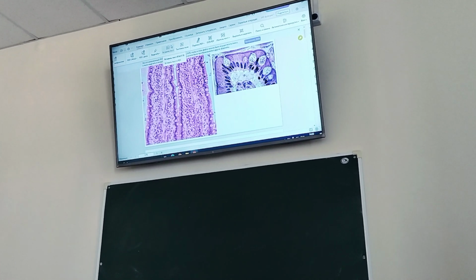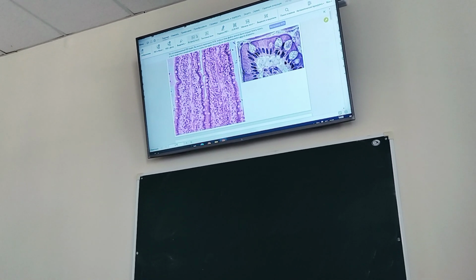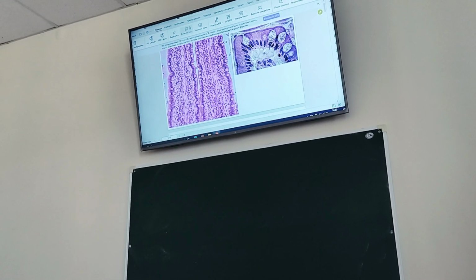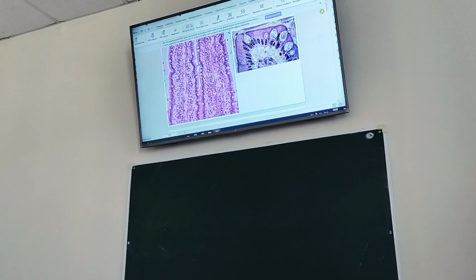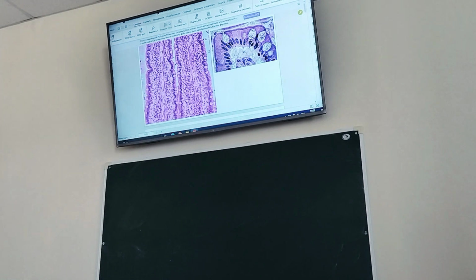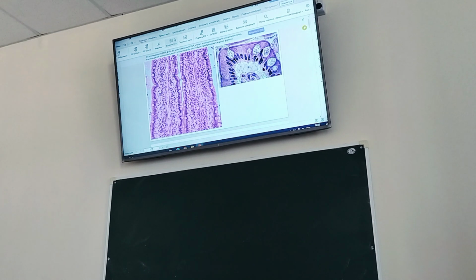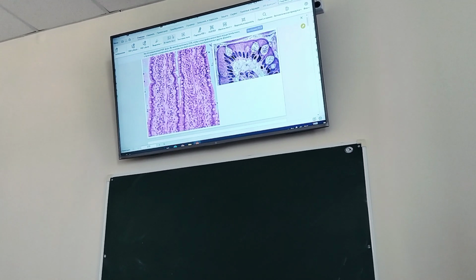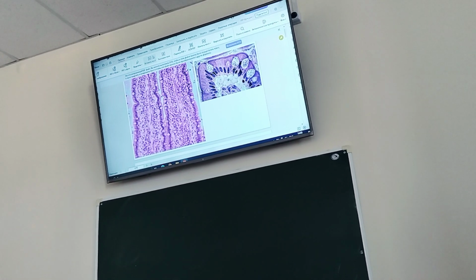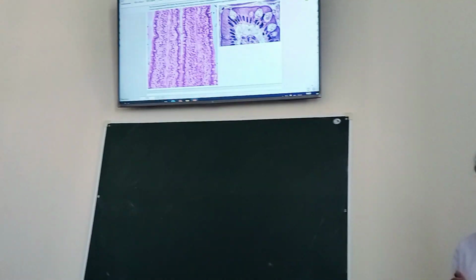You remember we exercised a few weeks ago. You should be based on the relative size. You start with the relative size in comparison with erythrocytes: larger than erythrocytes, smaller, or similar in size. Then you describe the shape of the nucleus, the density of the nucleus, condensed or weakly stained, darkly stained, euchromatic, heterochromatic, then segmentation of the nucleus, segmented or granular unsegmented, mononuclear.